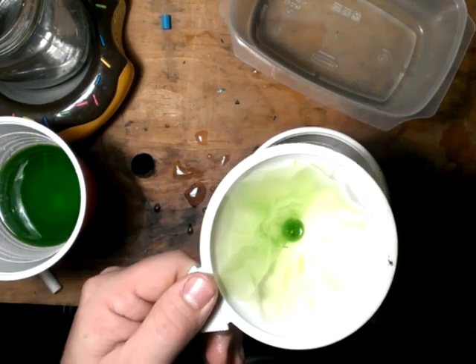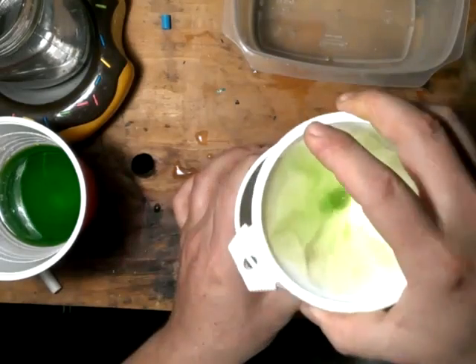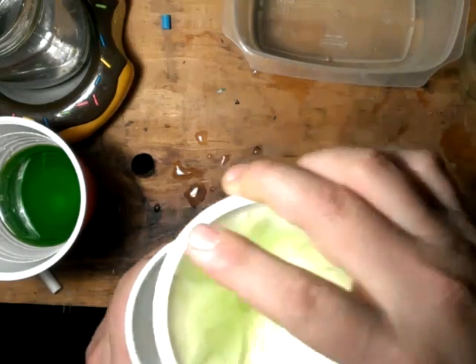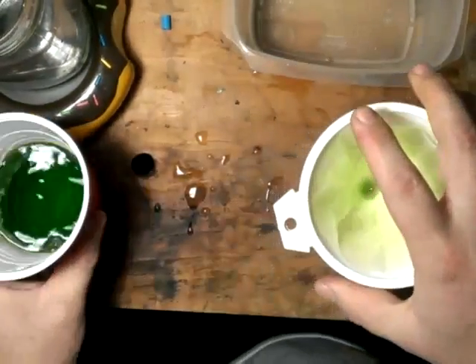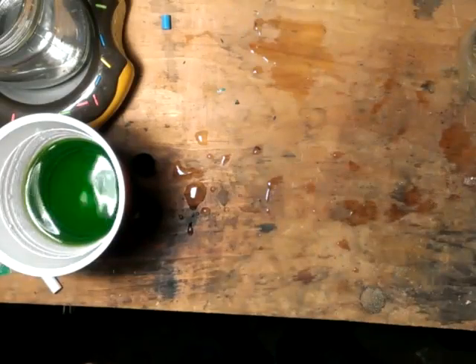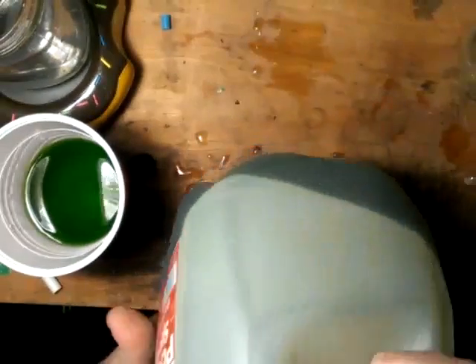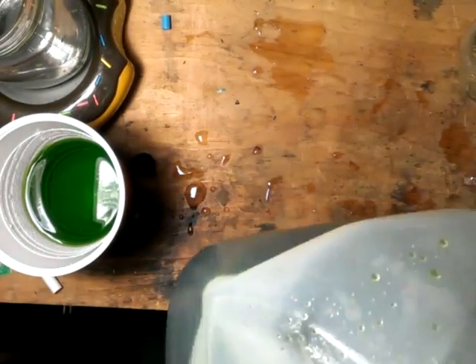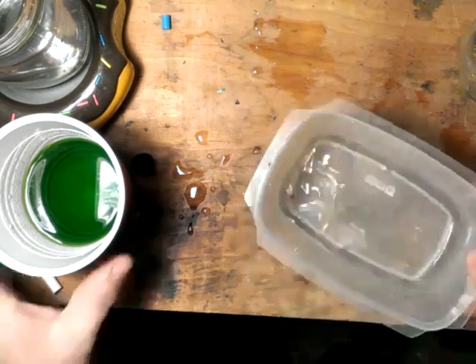Now what I like to do is run everything through again — out of this jar, back through the filter and get it all condensed with the smallest amount of water as possible. We'll let that cool off — this is still hot from being on the warmer. I'll let that cool off before I add it to the rest of my leftovers, which I save in a gallon container. Save all that old solution, and when that fills up I will pull copper out of this. I'll do another video on that.